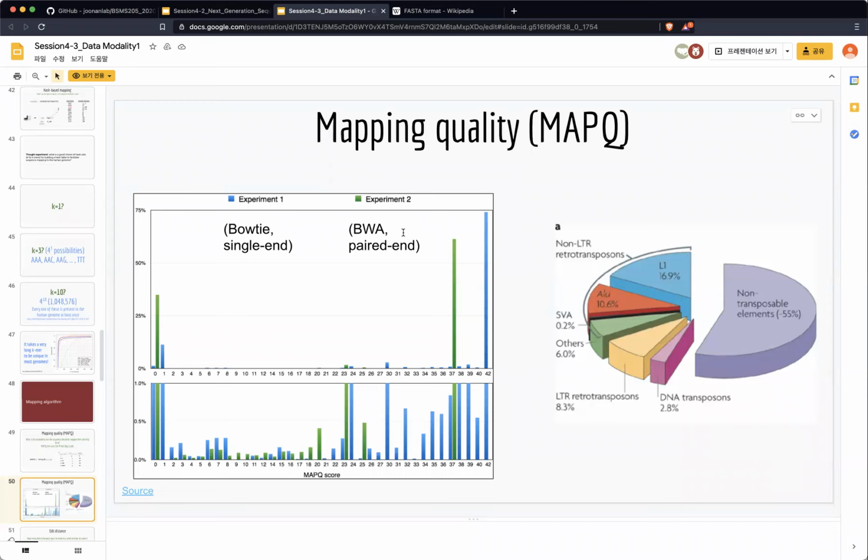And if you are working in bioinformatics, or if you are working in genomics, or if you are working in the clinical field with patient data sets of mutation or diagnostics, you have to be familiar with how accurate or how good your mapping quality is from your patient sequencing data set.